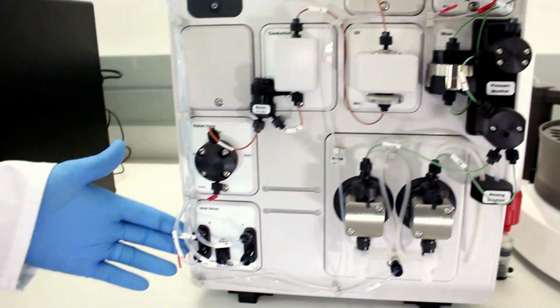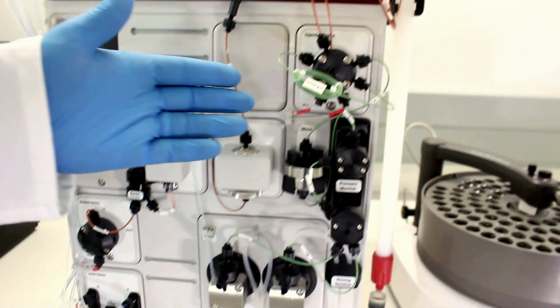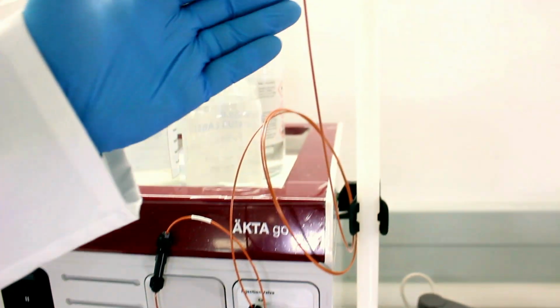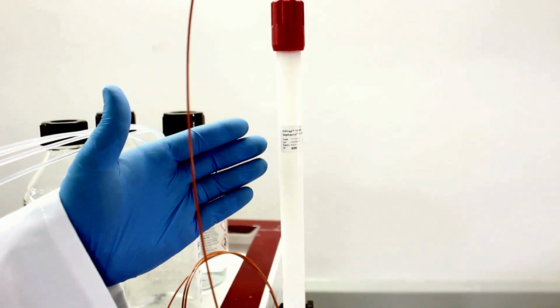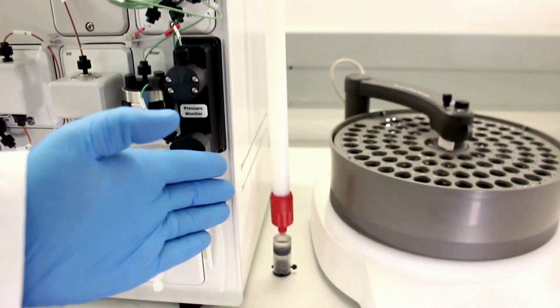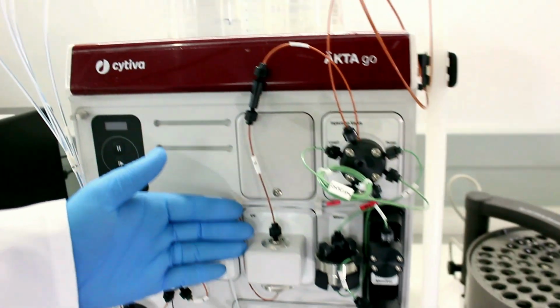From the inlet valve, the sample is also then sent up to the injection valve, where it is introduced to the flow path. From this valve, the flow will go into the column, where the separation of the proteins, impurities, and mobile phases takes place.